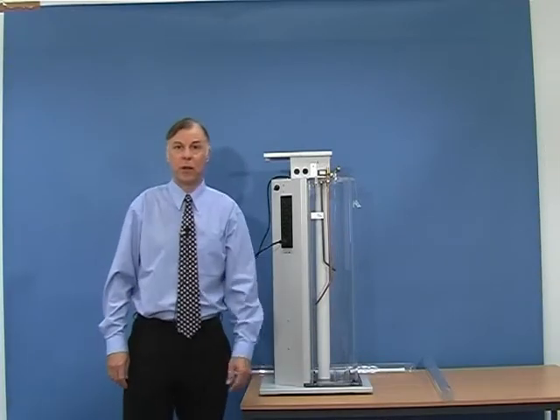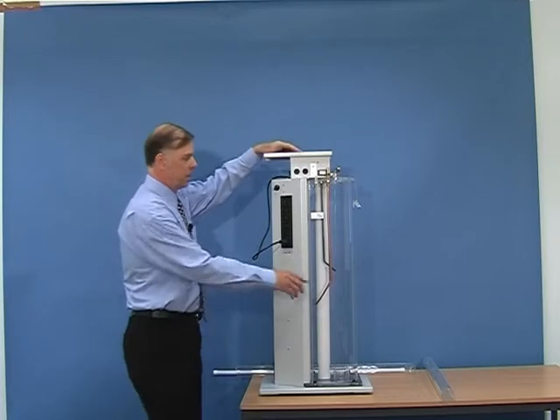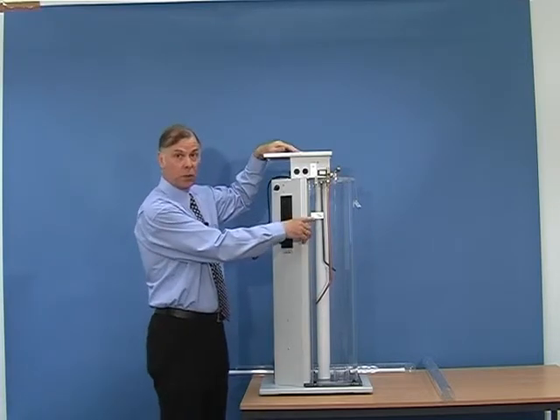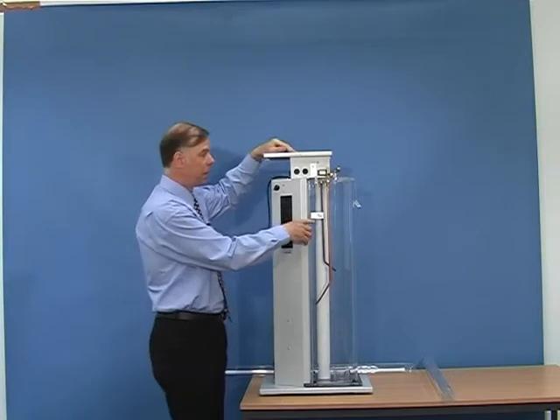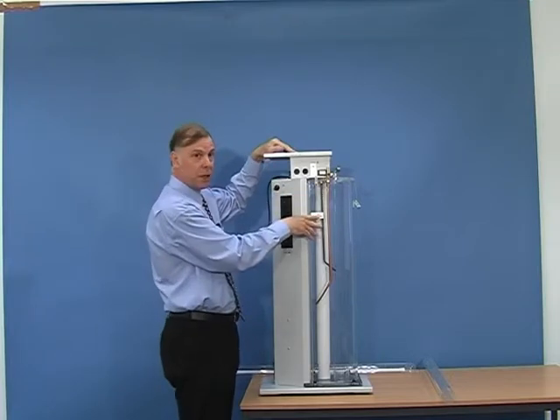I am now going to show you how to assemble the unit. The first thing we need to do is to fill the water jacket to this fill level using distilled water. The level will in fact be much higher than this once we have the unit assembled, but we will fill it to this mark as a starting point.